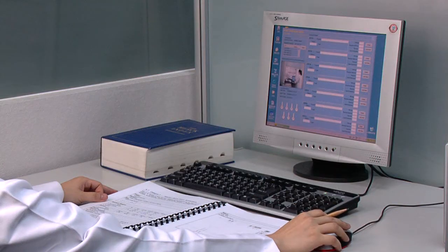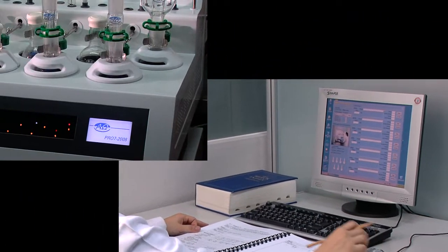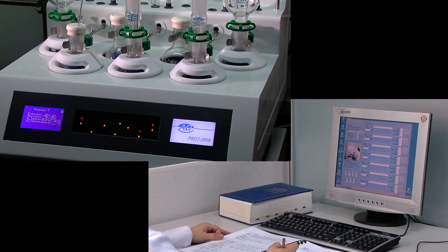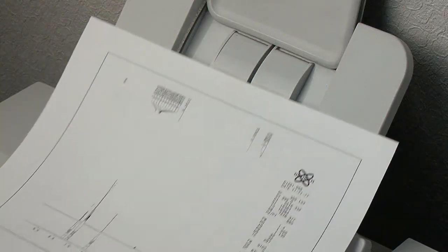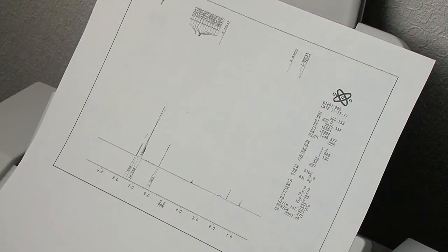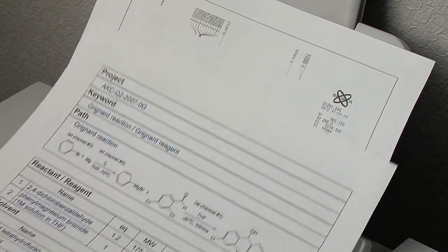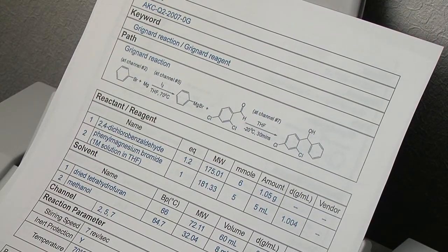The computer connection also allows chemists to free themselves from the bench and remotely monitor the ongoing reactions. Once the reaction is completed, Pro7 PIN generates a digital lab notebook, making it extremely easy to track, store and retrieve the experiment data.